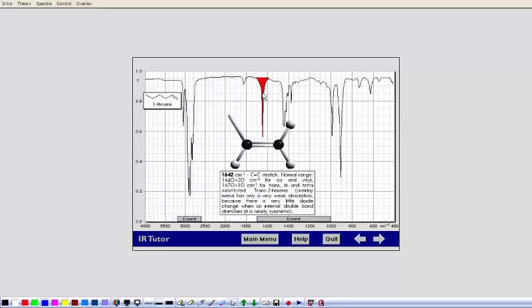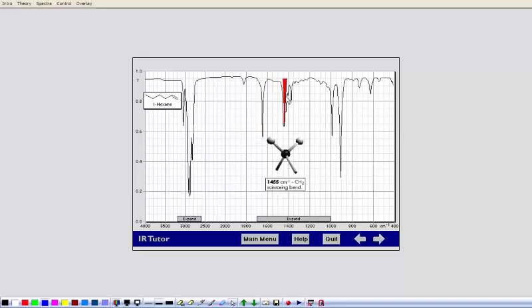But that's where a carbon-carbon double bond stretch would show up. It's about 1,600. And then we get into all the other types of stretches along the way, the scissoring, and these are all legitimate names. You can see that's called scissoring. And now we don't need to learn these. As a matter of fact, our version of infrared is going to be very simple.